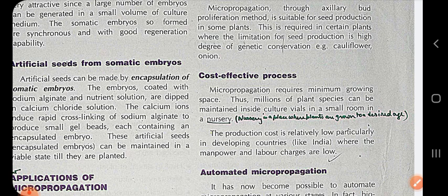It is very costly, so it is a one time investment, but it is very costly. Then all the glass vessels, vials, and the media that we are using for tissue culture are also expensive. But why do they say cost effective? It is the labor. Actually the labor cost here is low. The wages that we normally give to the labor here are low.